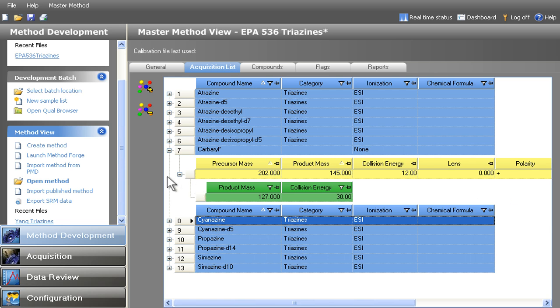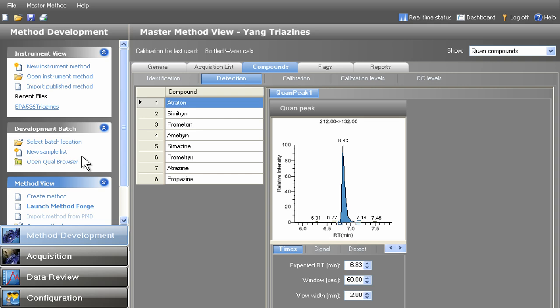For methods that have already been developed, TraceFinder's MethodForge makes method development a snap by using an existing raw file to automatically configure detection settings and ion ratios.